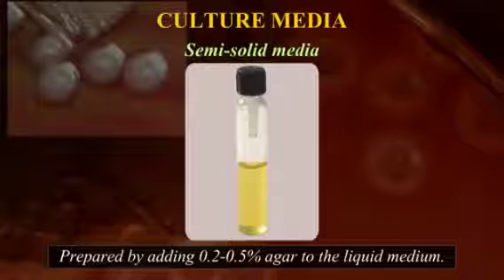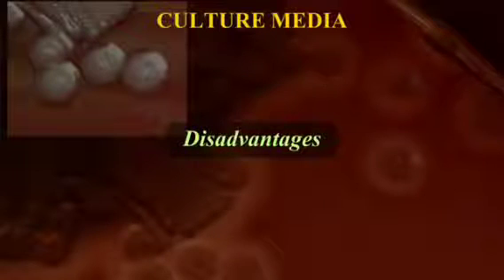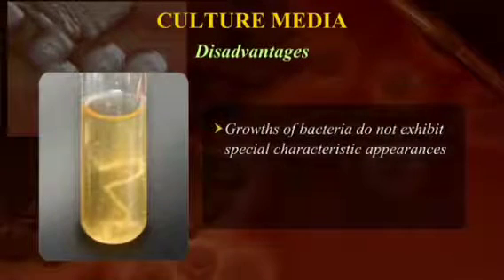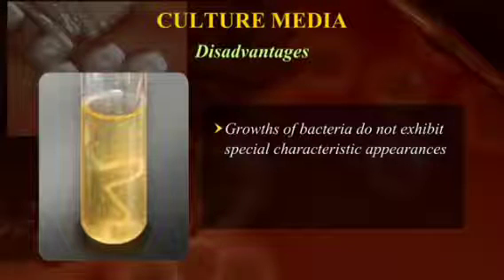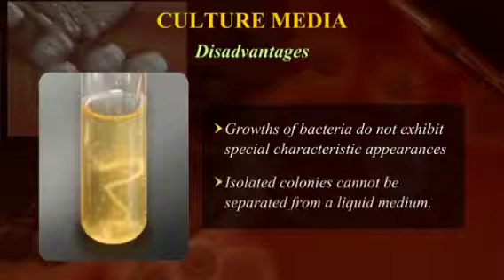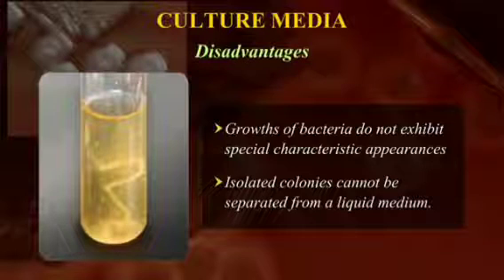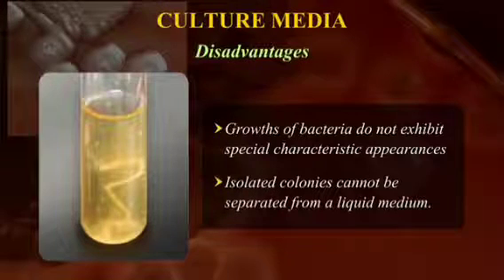Though liquid media can be fortified with different nutrients and permit growth of most bacteria, there are certain disadvantages as compared to the solid media. First, growths of bacteria do not exhibit special characteristic appearances and hence are difficult to identify. And second, isolated colonies cannot be separated from a liquid medium. Both these deficiencies can be overcome by a solid medium.